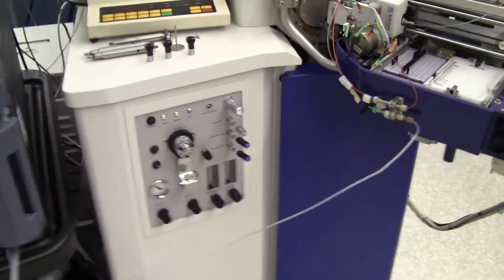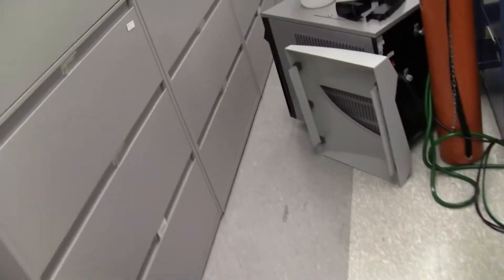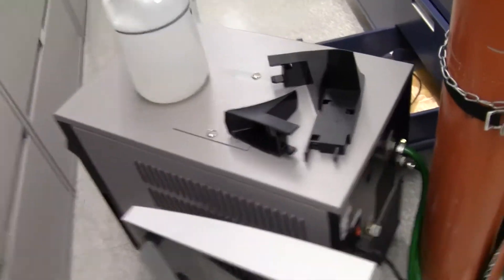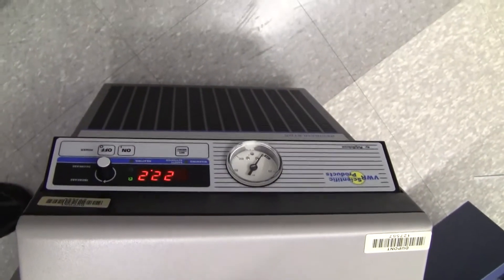It is going to come with a VWR PolyScient chiller, model 1171. Look at that. Positive displacement pump.